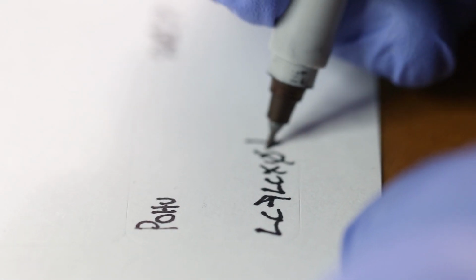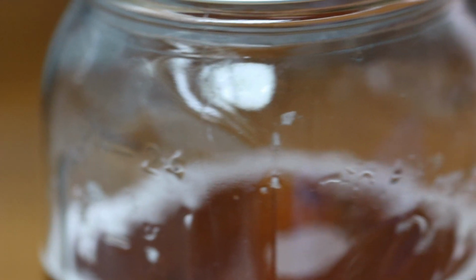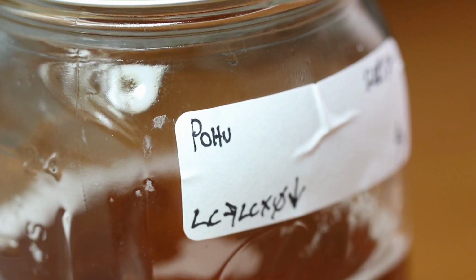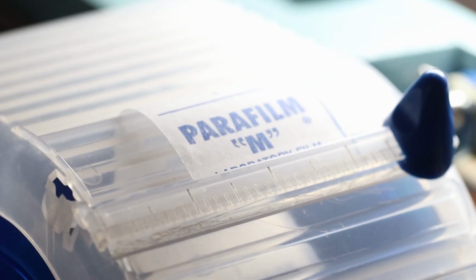We do the date. That was day 210 of year 24. And then that's my symbol. Then we do LC to LC times how many times? This is times 0 with the biopsy sign, so that everyone knows that this is a master jar. And then we just place our labeled information on here. Normally I would actually have the slant number as well under the Pohu name, but I forgot that during the video.